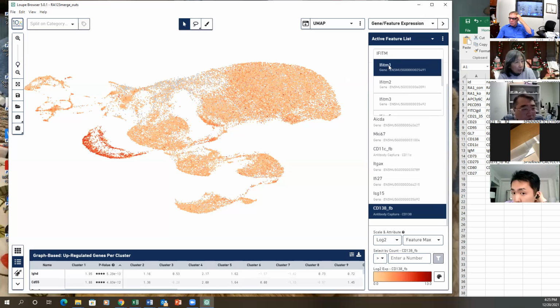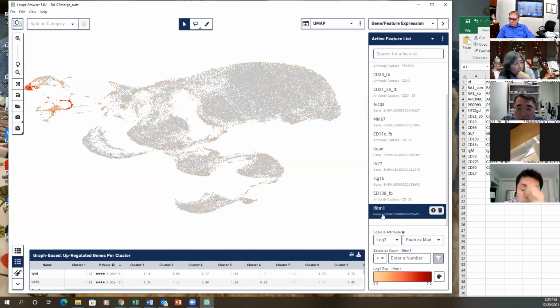So one lesson is, when I stain with the hash antibody, I stain a lot of cells. Based on this, finally, there are about 6 to 10% double negative. So some cells are not stained. When you use a hash antibody, it's better not to stain too many cells, so just make sure they all can be stained.